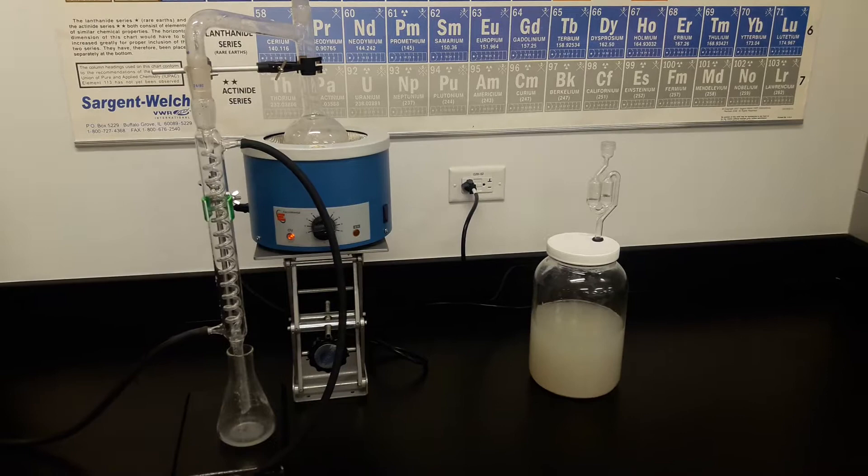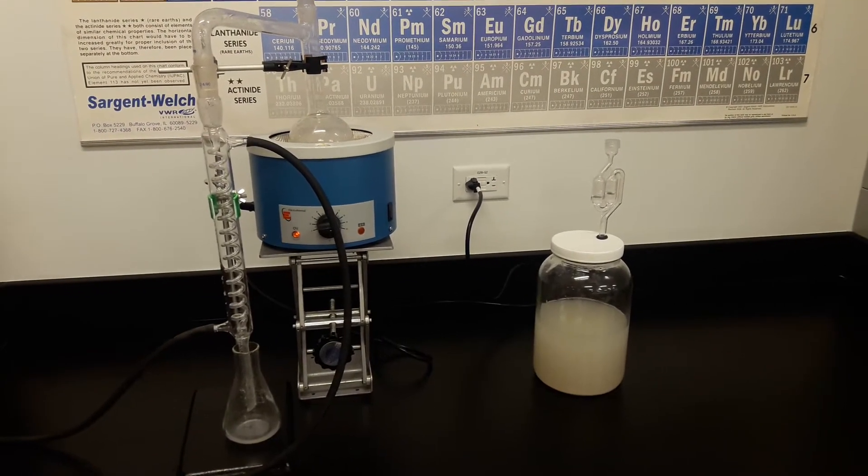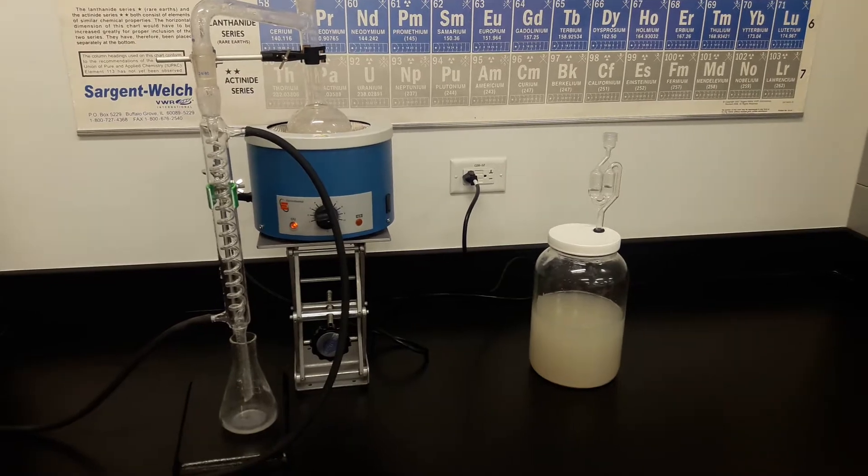On the right hand side we've got our fermentation jar. The fermentation jar contains a mixture of water, yeast, and sugar.